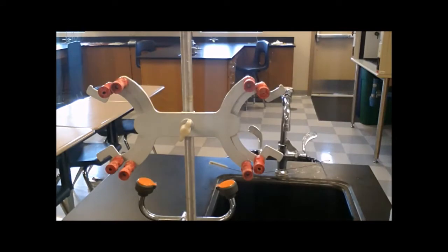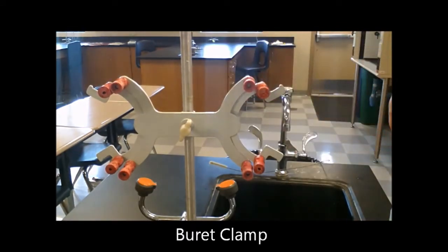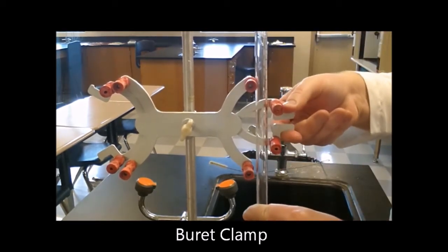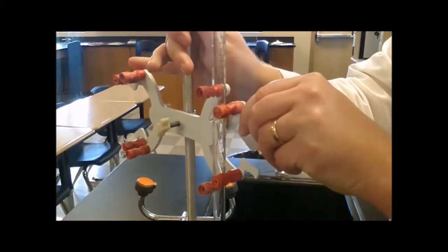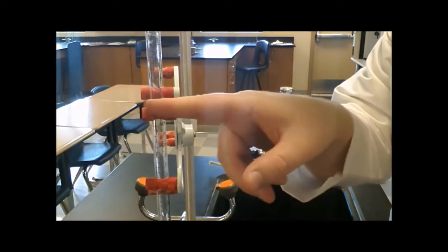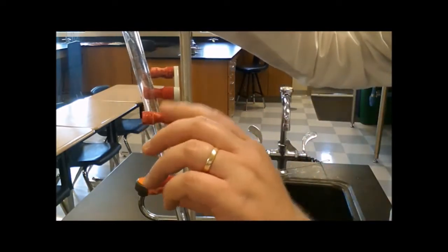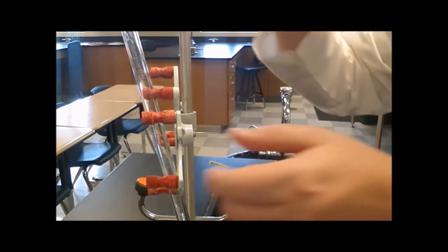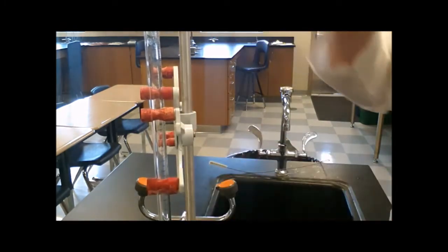Second thing, Buret clamp. The Buret clamp holds the Buret. You want to make sure that the Buret is snugly in between the divots in the Buret clamp. You'll notice that the Buret clamp has little divots that the Buret rests in. If you clamp your Buret sideways like this, it's not in the divots, it's not very stable, and your meniscus isn't going to be pointing straight up and down. You want the Buret pointing straight up and down.